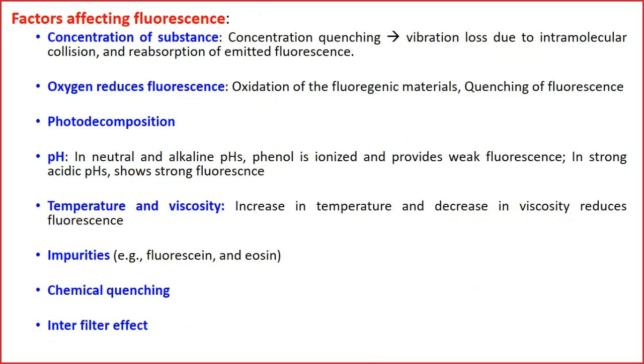Then, factors which can affect fluorescence. The first one is the concentration of the substance. You have to remember that while you are measuring fluorescence, the solution has to be dilute.